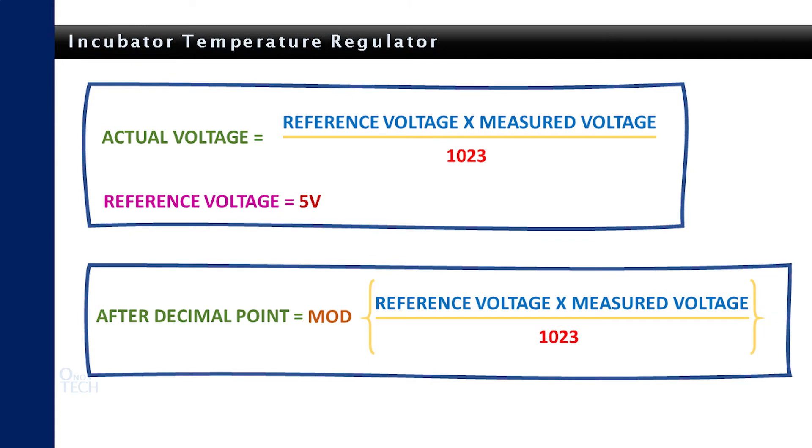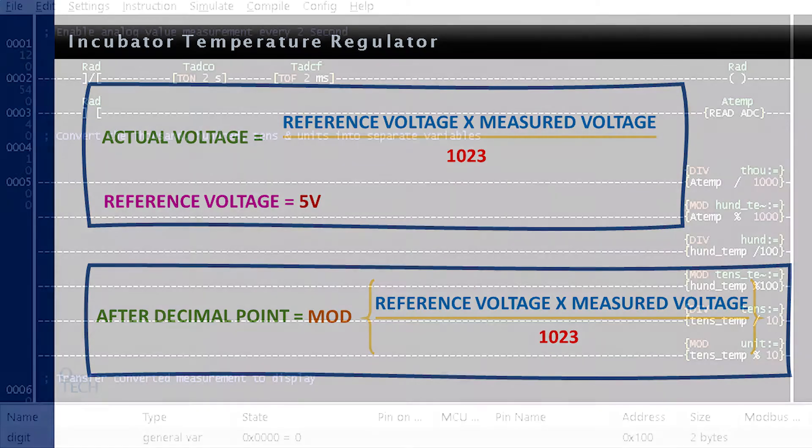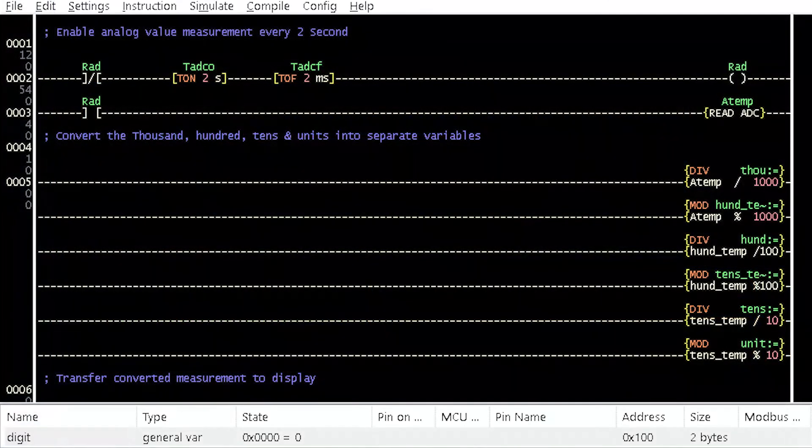To display the value after the decimal point, the remainder value from the actual voltage equation is calculated with the mod instruction element.